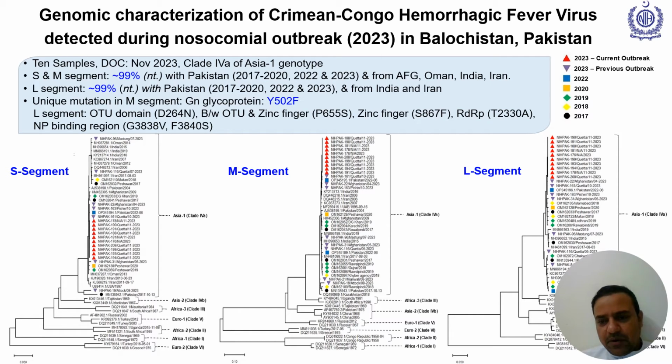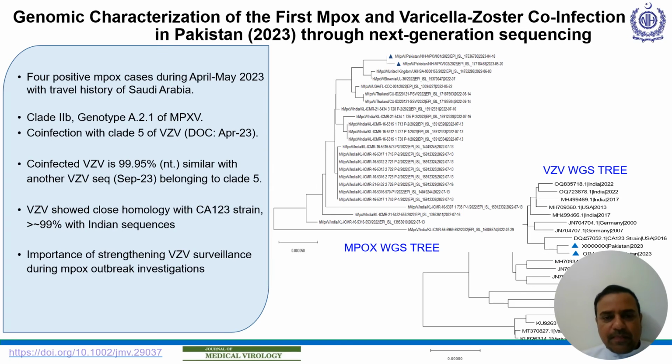previously we used to do partial sequencing of CCHF virus based on the S segment. But with partial sequencing, you cannot determine recombinations or mutations in other genes. So again, using this metagenome approach, we managed to sequence the whole virus, and we also found some unique mutations in the M and the L segment. So again, this highlights the importance of doing next generation sequencing or whole genome sequencing of different viruses and pathogens.